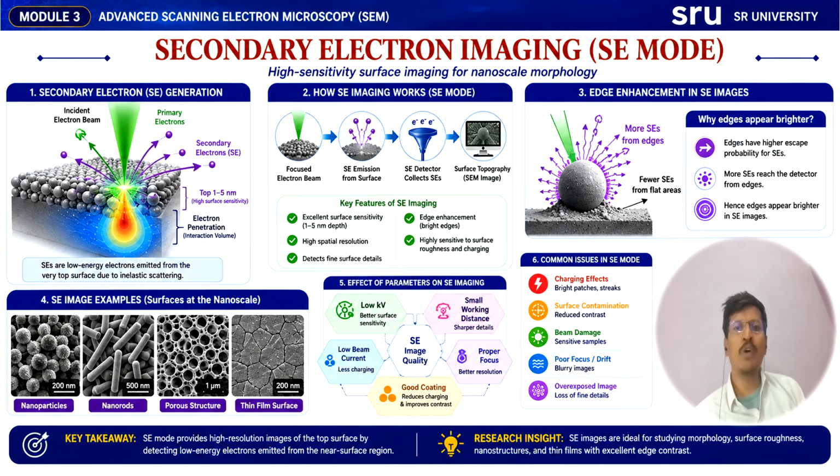Conductive coatings such as gold or platinum can also improve the image quality by minimizing the charging effect. That's why before doing the sample analysis, the sample will be coated with either gold or platinum to excite the electrons more.